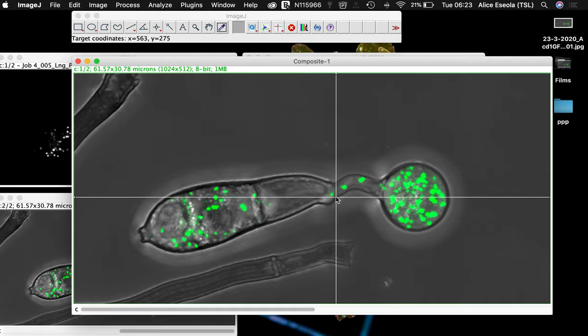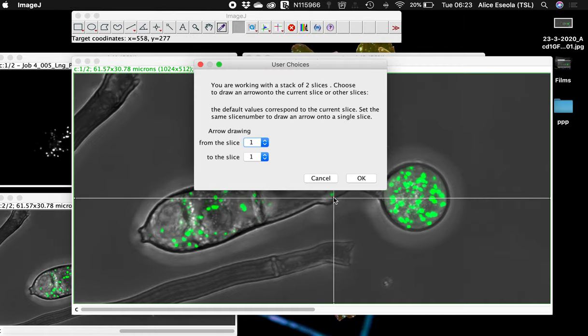Go to set drawing location. If you want to point at this small object here, we'll drag the navigator to the place. Because it's a single slice, we'll say okay. If you have more than 20 slices, you can select from slice 1 to 20.